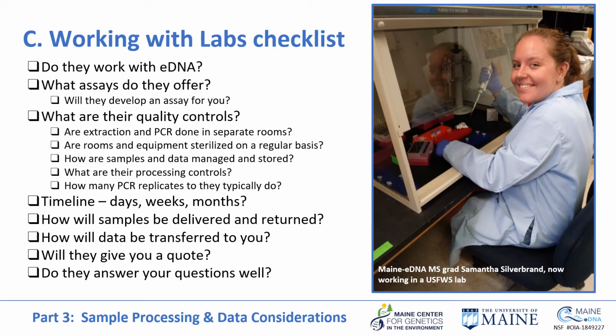Another thing is, how is data going to be transferred to you? This can really matter if you do metabarcoding, because you can't just email that data. You have to figure out a way to transfer it to you. Also, every lab should give you a quote for the work that they're going to do, and they should also be able to answer all your questions pretty well.